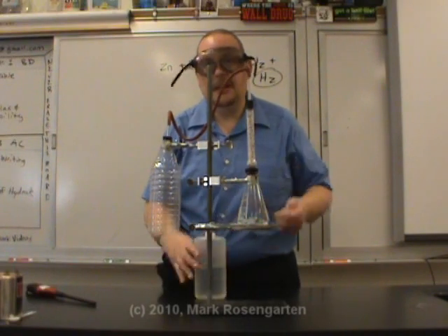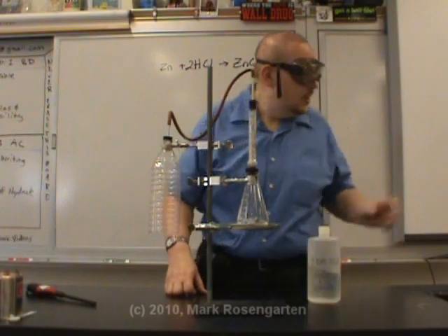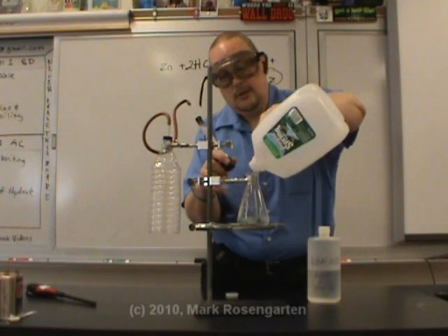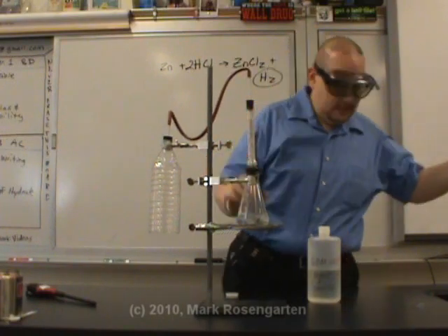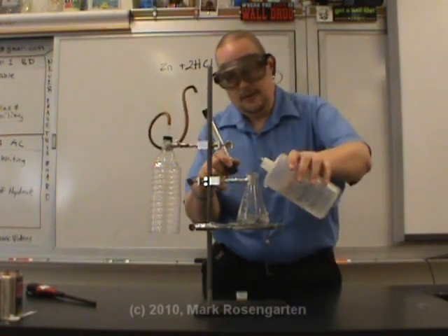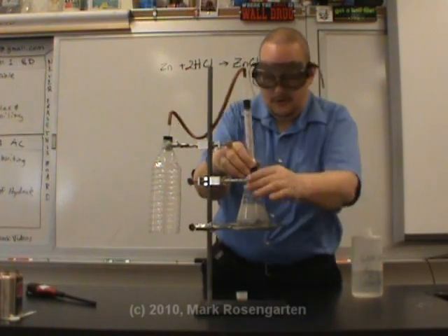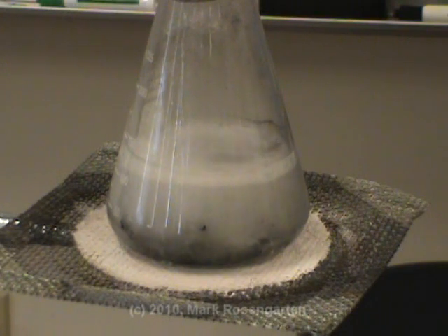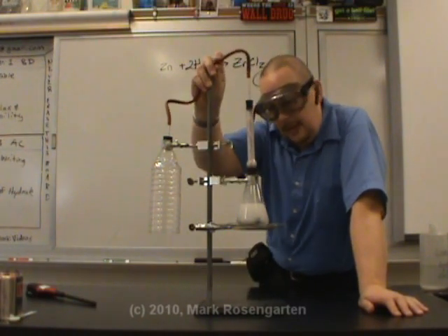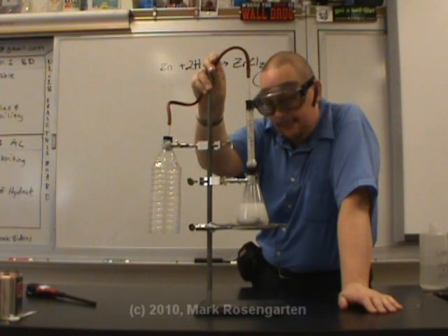Now let's throw the hydrochloric acid in now that I am properly outfitted. Before I start this experiment, I'm going to dilute this down a little bit — this is 6 molar hydrochloric acid and that's a little bit stronger than I really want it. So I'm going to put a little water in here first just so that the reaction takes place less quickly. Into that we are going to place our hydrochloric acid. Let the experiment proceed. It's generating some hydrogen gas, not a lot. I don't want it to be produced too quickly — I don't want it to overwhelm my system because it's fairly sealed up, so I don't want it to produce so much gas that it actually blows this thing up.